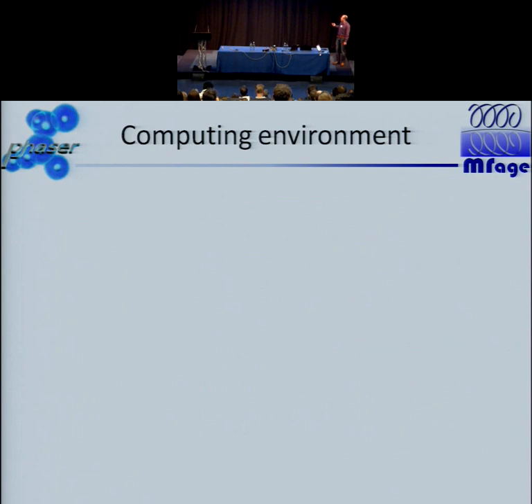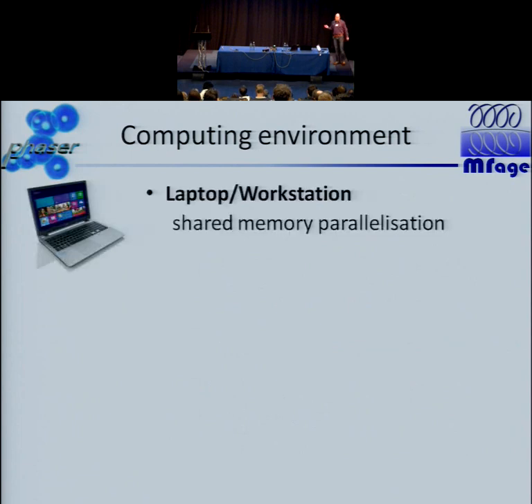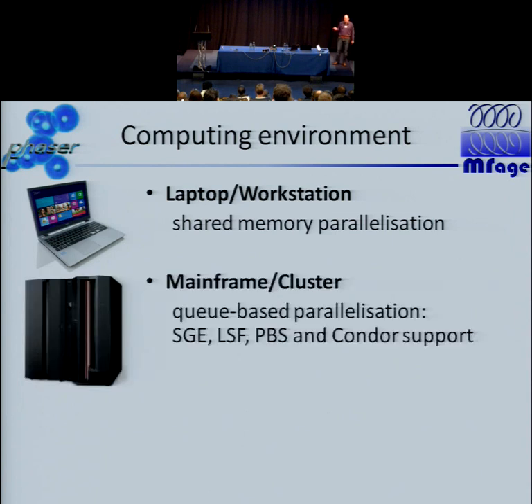So what do I mean by the computing environment? First, we allow you to use all the processors that you have in your laptop or desktop machine via shared memory. However, if you want to go to a larger scale, then you can use a mainframe computer or a cluster machine. And this normally goes through a batch queue system. There are a number of queue systems that we support, Condor being the latest addition.